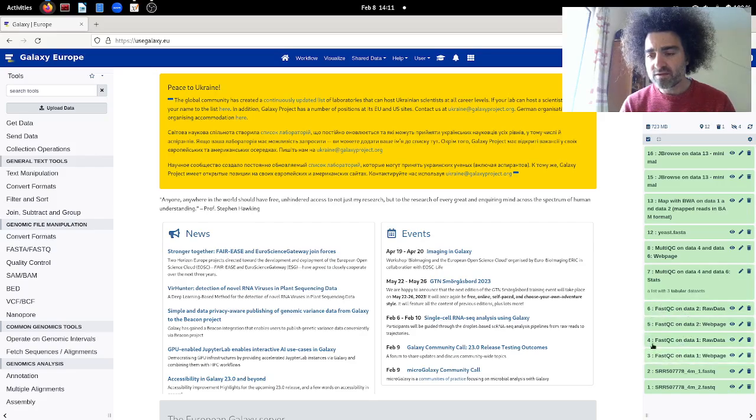And then I combined this quality control analysis in a MultiQC analysis just to be able to visualize them together. And then I uploaded the reference genome for the yeast, but I don't really need it because Galaxy already has it. Then I mapped the reads on the reference genome, and then I visualized data on JBrowse.